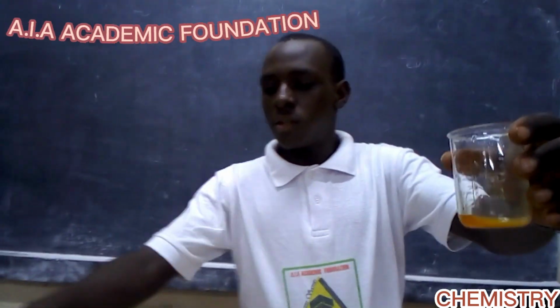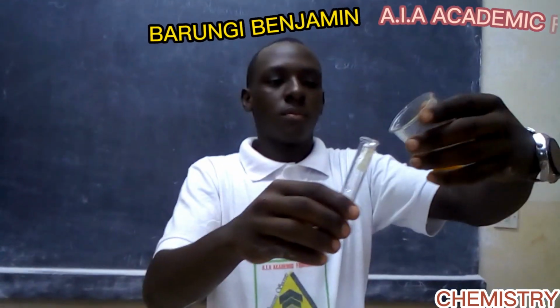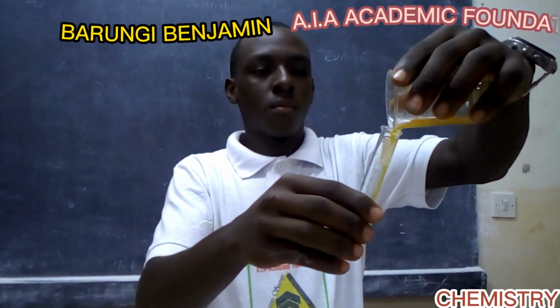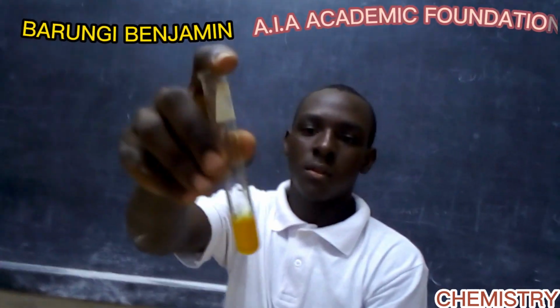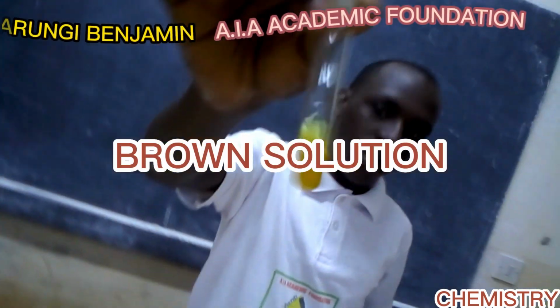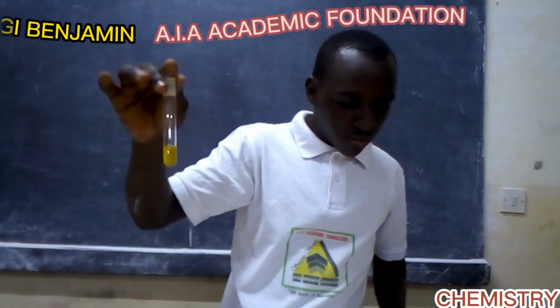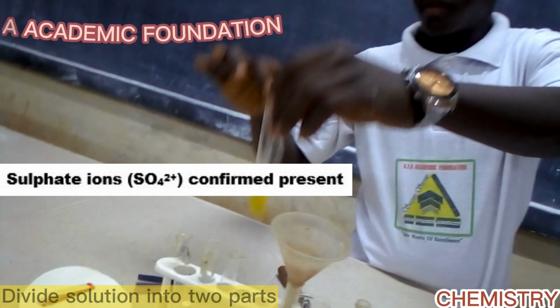Now we have dissolved it. I'm going to put it in a clean test tube. This is it. We have obtained a brown solution. Now they have told us to divide the solution into two parts. We are going to divide the solution into the two parts.